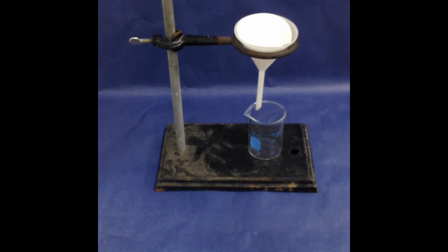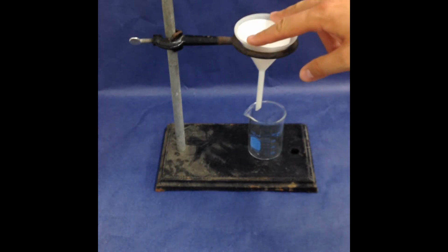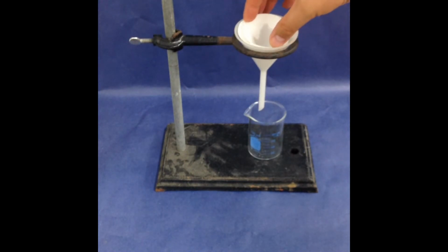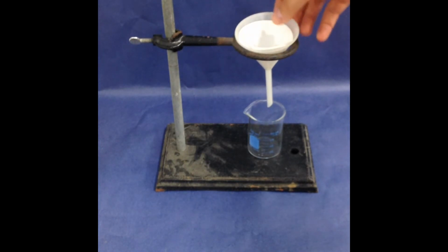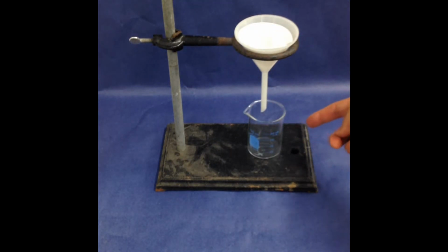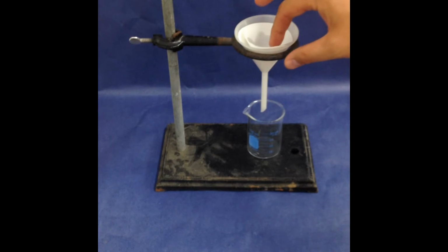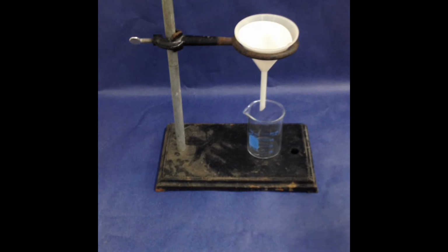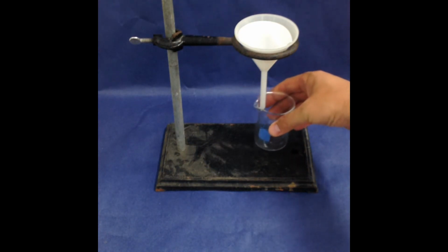Now you can see this paper is a little bit stubborn. It's sitting nicely inside the funnel, and if you really wanted to make this paper stay inside the funnel, you can add a little distilled water and wet the filter paper a little bit, not too much, because you don't want to have liquid dripping through, and that's going to possibly alter the volume of the filtrate, which is the liquid that's going to come down here. So you just want to wet this a little bit so that the paper sticks to the funnel and stays inside the funnel. And like I said, always have something below to collect the liquid.